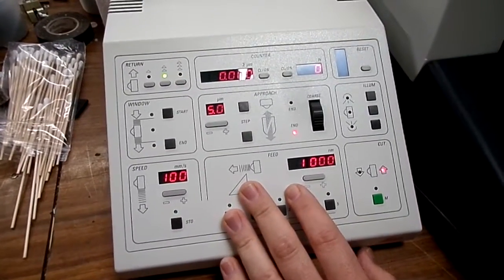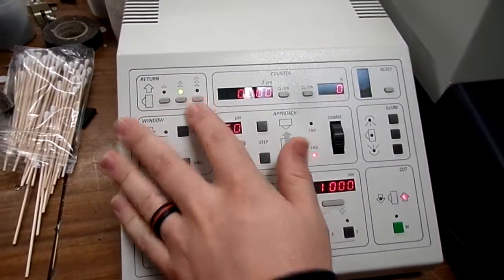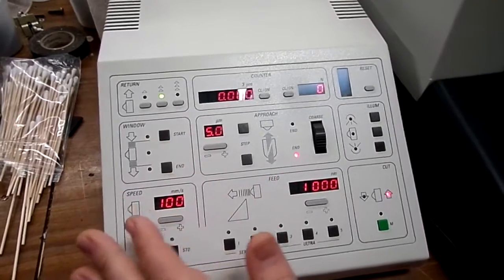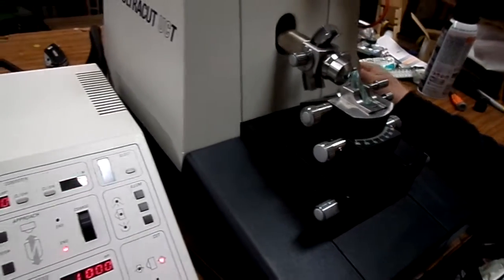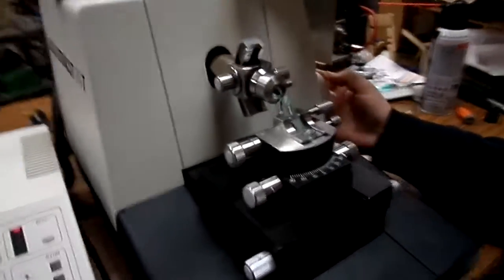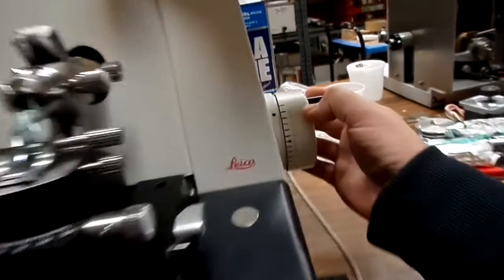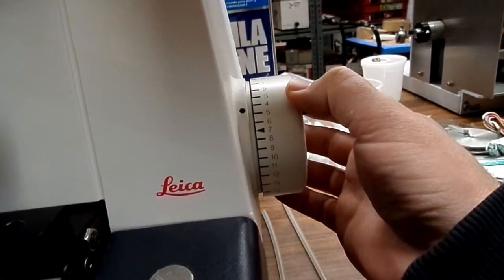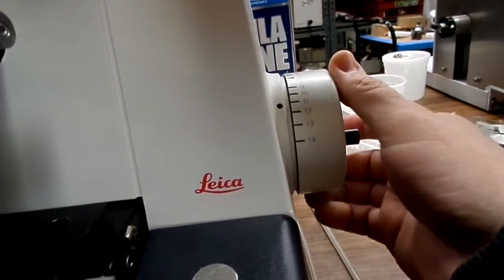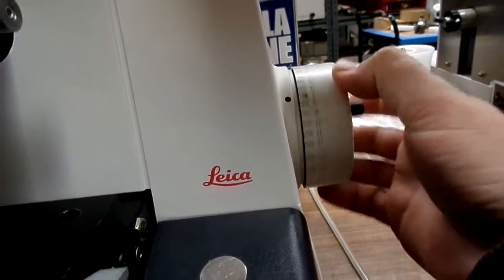Then we have the controls on our controller. You have return speed for when the head is retracting. Cutting window. With the cutting window, if you look on the hand wheel, you'll see different numbers here. And if it's within those numbers, that's where you can set up your cutting window.